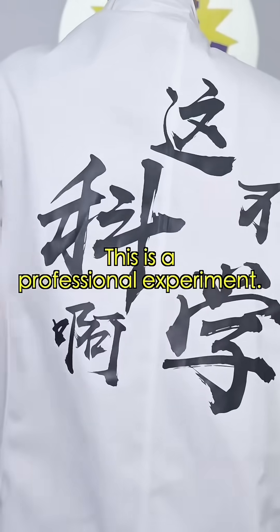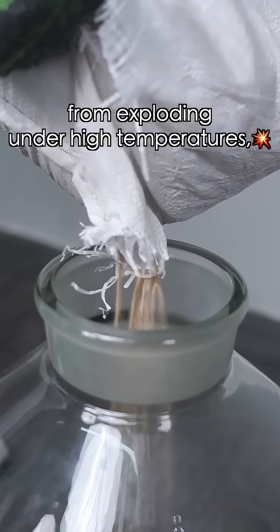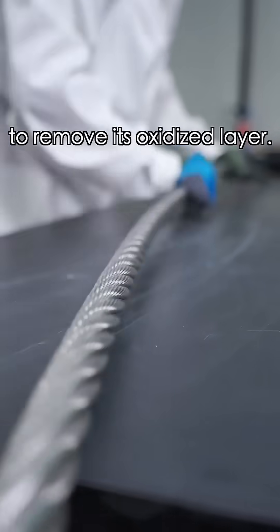Friendly reminder: this is a professional experiment — do not try this. First, to prevent the gas collection bottle from exploding under high temperatures, we put a thick layer of sand at the bottom. Next, to make it easier to ignite the steel cable, we use sandpaper to remove its oxidized layers.